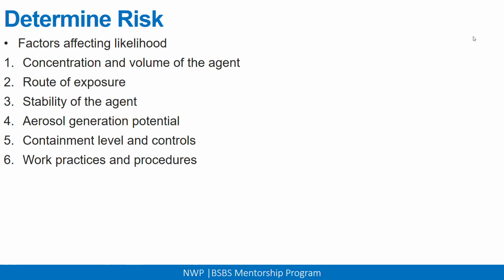If you are not disinfecting, cleaning or decontaminating your benches, each and every person who touches that bench without gloves will get contaminated with that particular agent. So poor work practices and procedures will increase the chances of exposure to the biological agents you're working with.